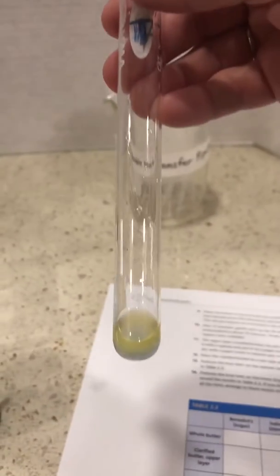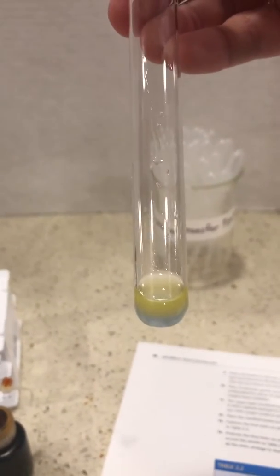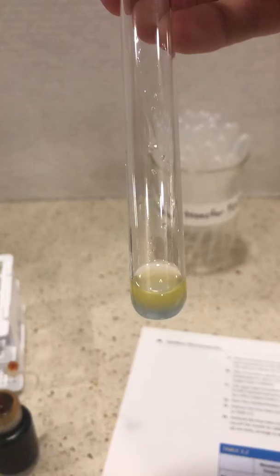Now I don't know if you can see this very well, try to put it on white. The blue bottom layer is actually the biuret and the butter, the top layer, is floating above.